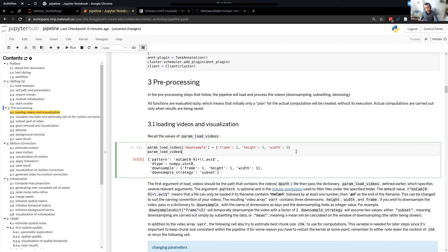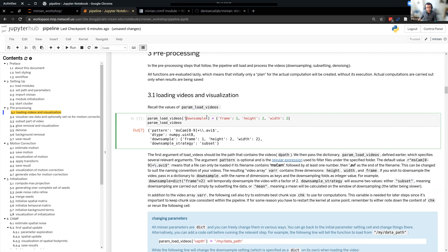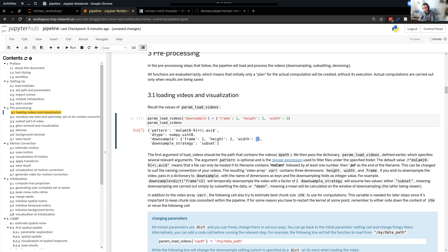Make sure you're downsampling by 2. If you run this cell, because we're printing after setting the values, you should be able to see the settings reflected in the printout.